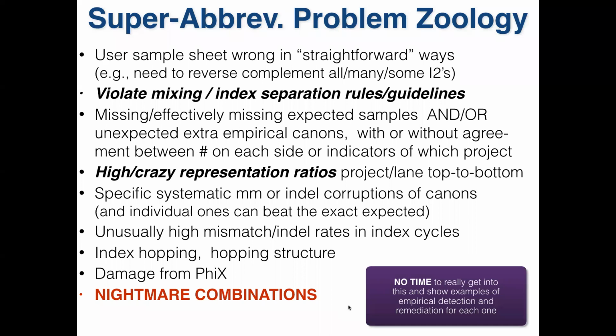So if you're on NovaSeq version 1.5, it may be one thing, but if you're on an iSeq or whatever, it's different. And your documentation kit, as long as it's not a really old kit, will actually have multiple columns for the Illumina platforms.